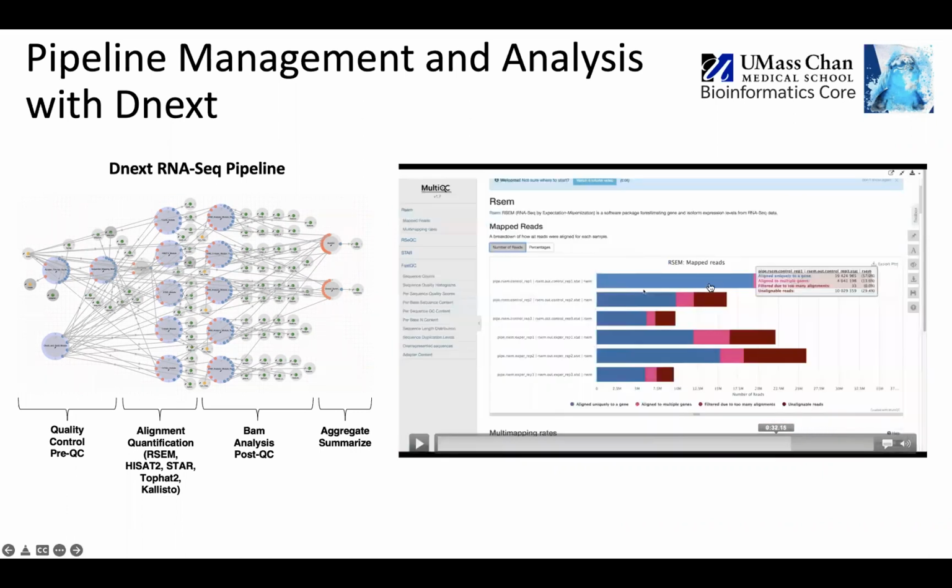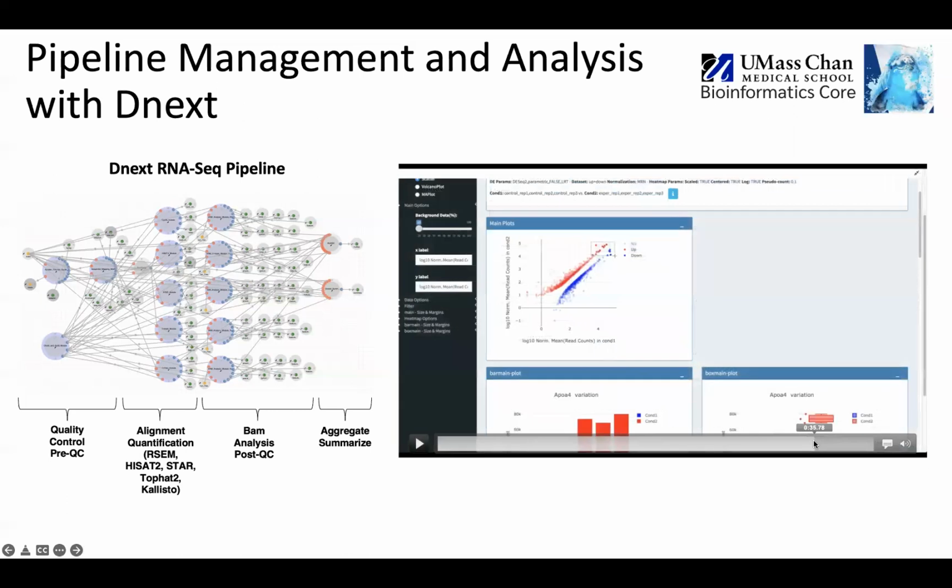You will have other files there, like tables that you can do differential expression analysis, or other tables that we perform lots of other algorithms to analyze your data. One of them is, for example, differential expression analysis that you did manually here, that we're going to show how to do with R in the next session. But basically, we have this D browser here that you load your file there, choose your conditions, and then press a run button, and you're going to have differential expressed genes.